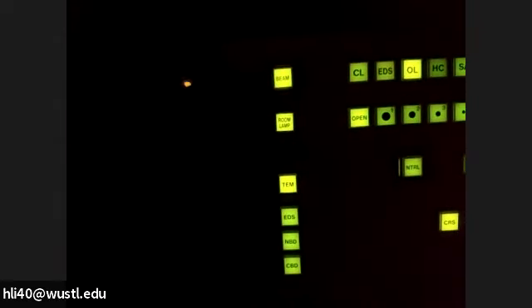I'm going to turn up the light. You should still see the beam. You're supposed to do that in the dark. You're still supposed to see the beam on the screen, and then the next thing you need to close the beam, which is you just need to click the beam button here. You see the beam button in the middle. Just simply lift the cover, single click. So now the screen is black. You can put this cover on, and then we can turn the light.